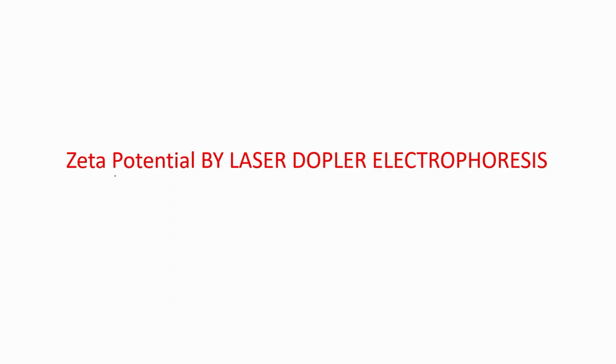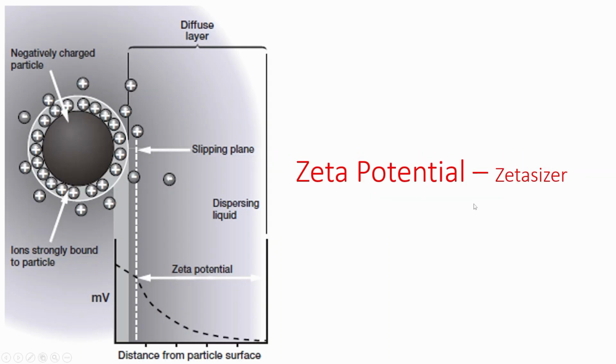Welcome. In this video we will learn about the concept of zeta potential and how to determine zeta potential by laser Doppler electrophoresis. Let us first understand the concept of zeta potential from the figures on the slide.